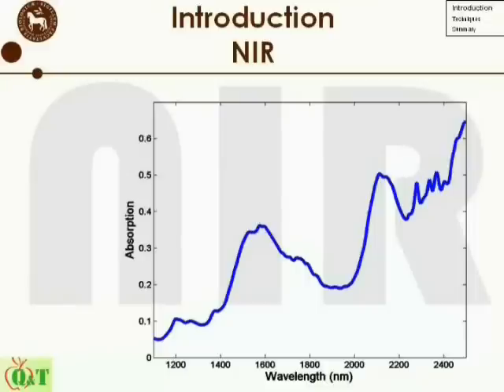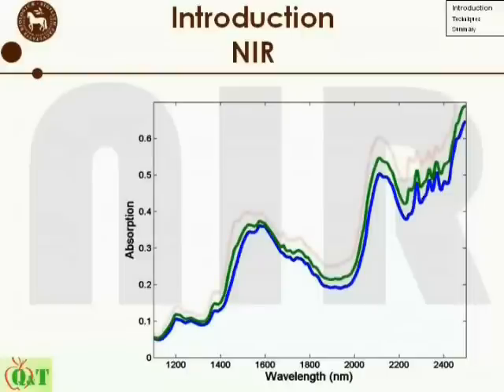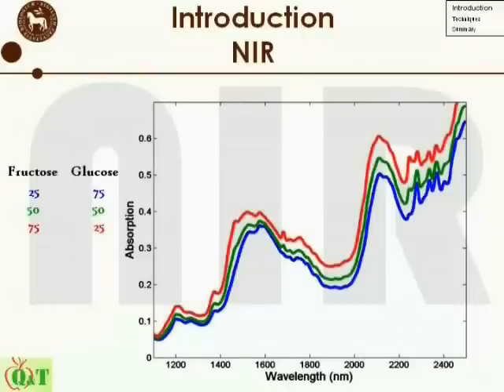Here you can see three recorded NIR spectra from 1100 to 2500 nm. These three samples are very simple — they are just mixtures of two sugars, glucose and fructose. The concentration of fructose is gradually increasing from 25% in the blue, to 50% in the green, and 75% in the red. As you can see from these three simple spectra, there are three features which are unwanted, especially from a PLS regression point of view.